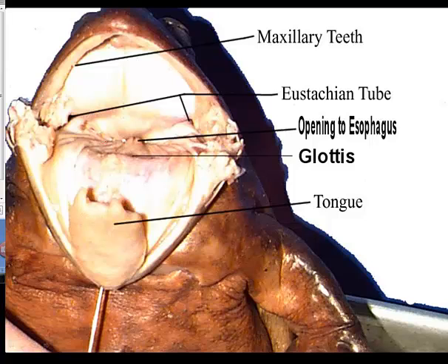There are two openings along the top part of the mouth. In the back, these openings are the eustachian tubes. You're going to have to really open up the mouth and look at the path that the eustachian tube takes. Take your probe and follow the path of the tube straight back, and you'll see that the probe will poke out of the tympanum on the outside part of the frog. The eustachian tube equalizes air pressure in the ears and mouth, so it's used to help get sound to vibrate through.